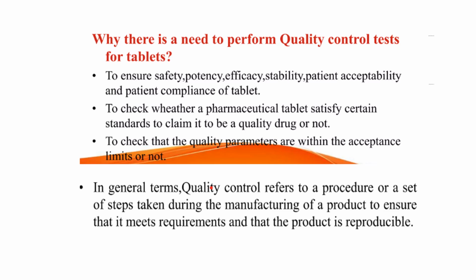So, what is the need for quality control tests? It is to ensure the safety, potency, efficacy, and patient compliance of a tablet, to check whether the tablet satisfies certain standards, and also to check that the quality parameters are within the acceptable limit. Quality control is nothing but a procedure, or steps taken during the manufacturing of a product, to ensure that it meets the specific or standard requirements that it should meet.